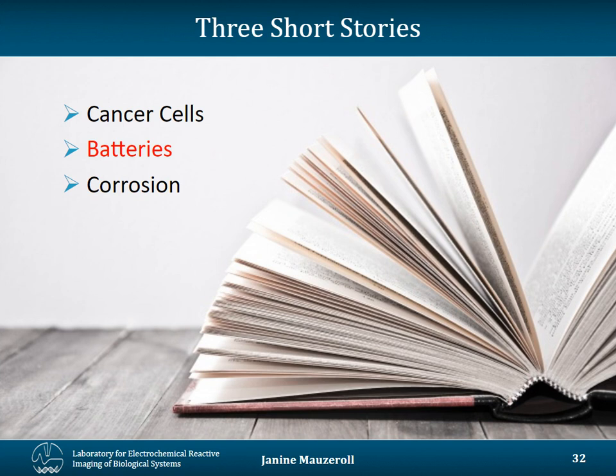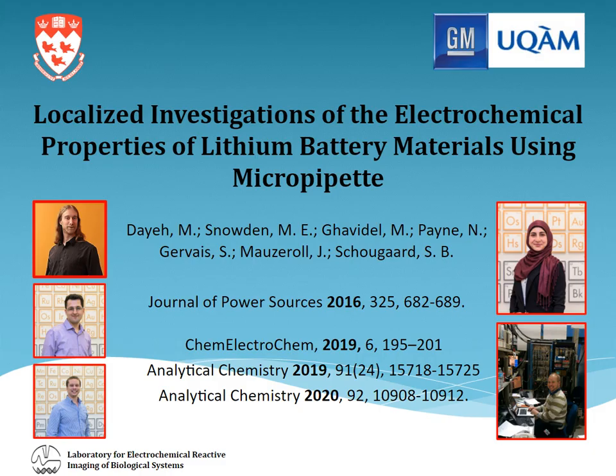Let me now switch gears and talk to you a little bit about how SECM can be used for batteries. And in this case, we will slightly change the experimental setup that we've been discussing up to now. There are many ways by which SECM can be used to study energy materials.